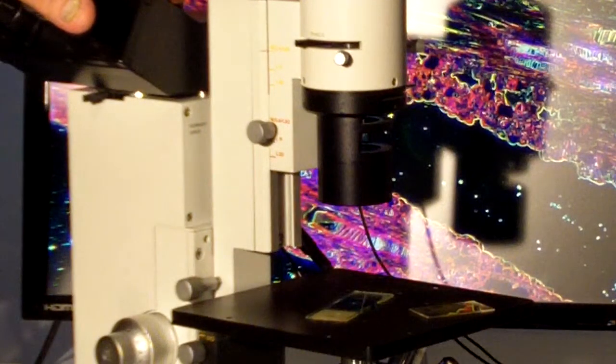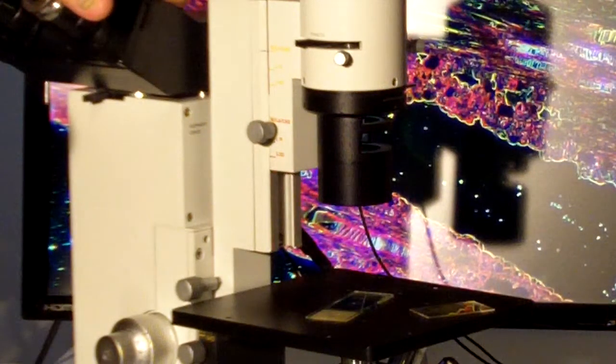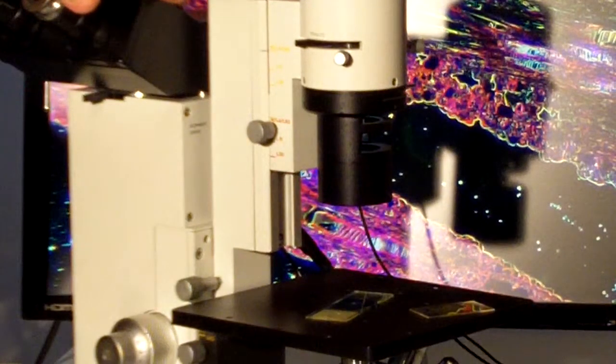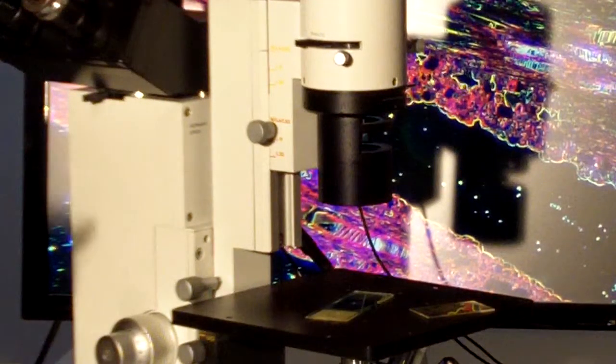Leitz Diavert, multipurpose teaching microscope, still available from Brunton Instrument. Thanks for your attention.